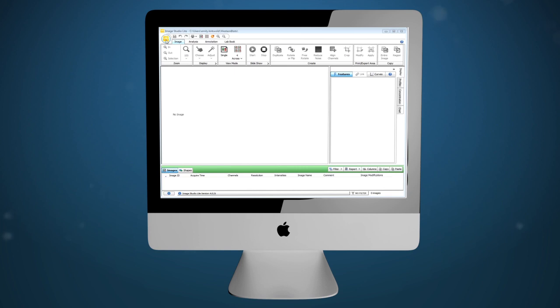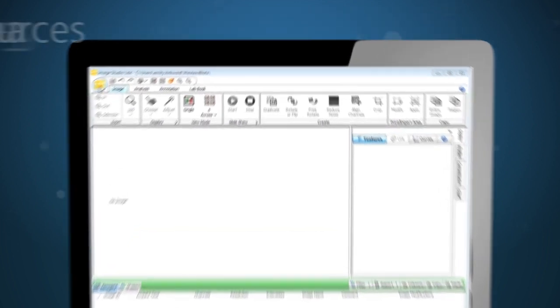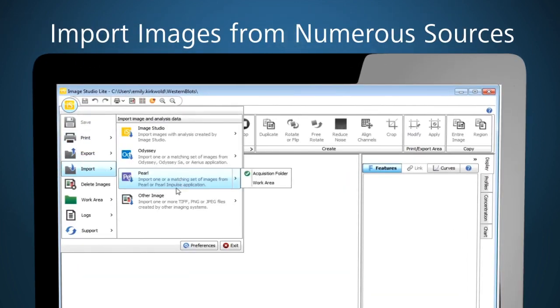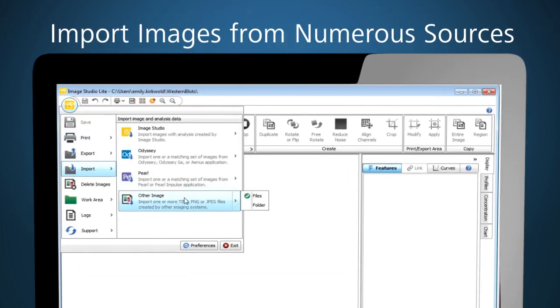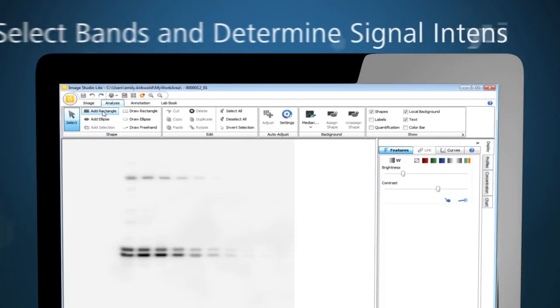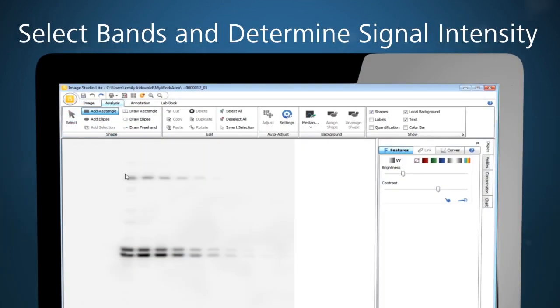With ImageStudio Lite, you can import almost any Western blot data file type for analysis. The program guides you through obtaining signal intensities for each band quickly and accurately.